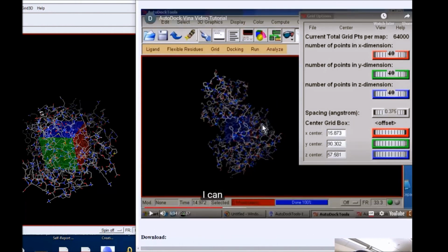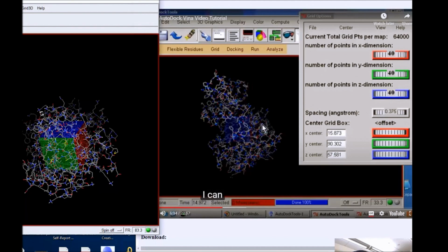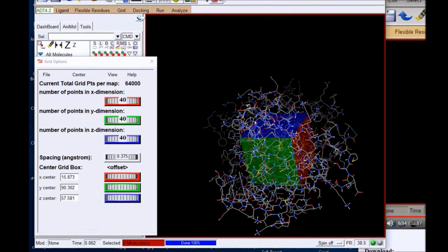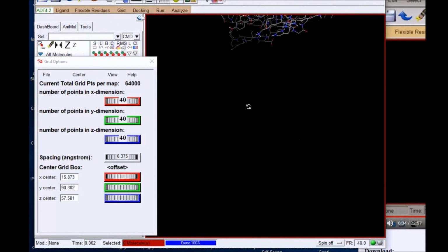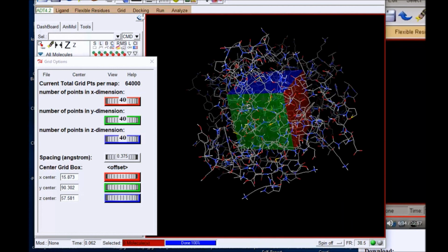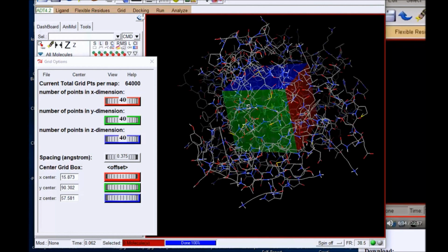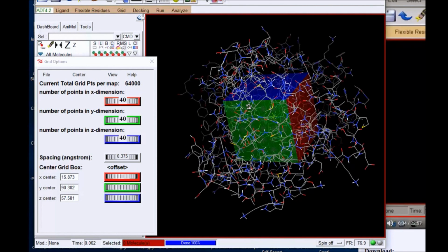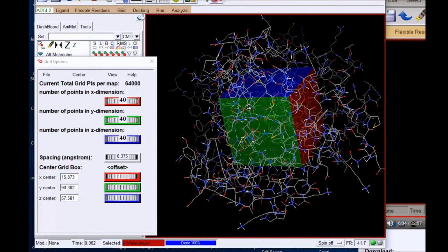I'm going to stop here for a second and say, well, let's do this something slightly different. Use the middle mouse to expand, so at least it takes space, and then the right can be used to translate. I'm using an ergonomic mouse, so it's slightly weird, but I'm going to fill it as far as it'll go, and then translate it down, and fill it as far as it'll go. Okay, I think we're good here, but we should be able to follow this just as well.